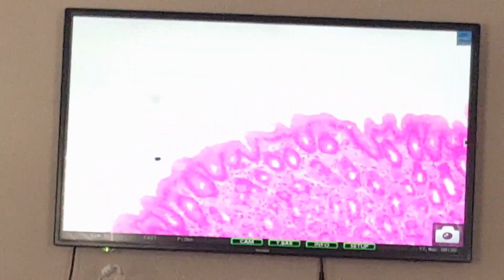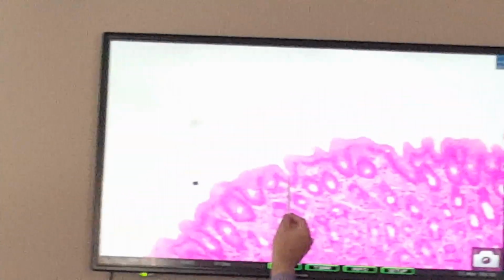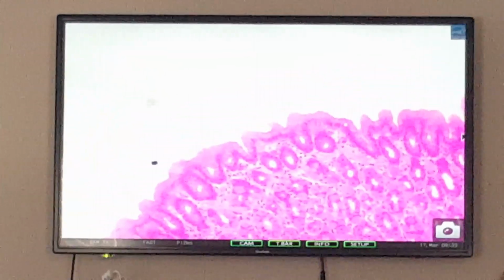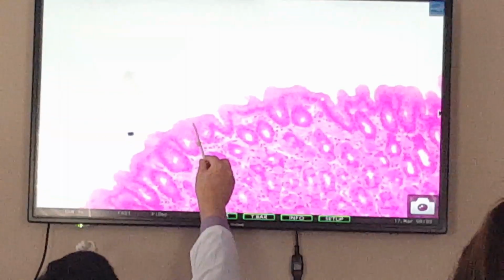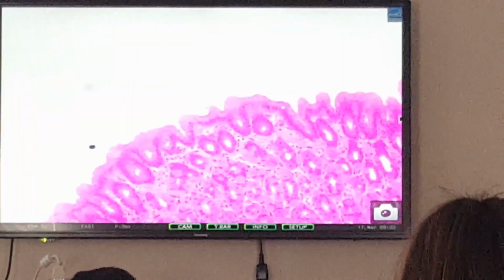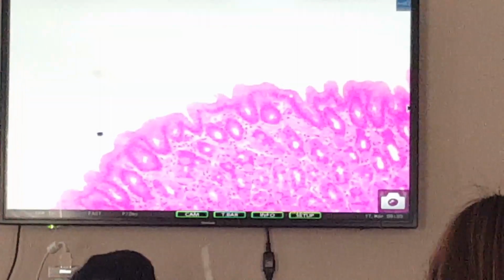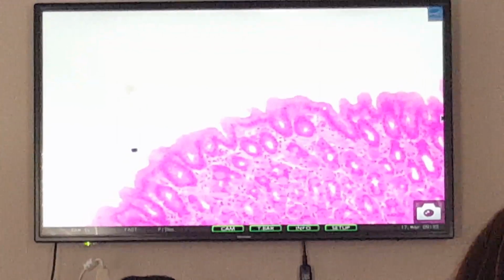So the stomach has goblet-like cells, and the reason we call them goblet-like is you see this light staining region along the apical surface of the cells. Well, that's a mucus-like material it's producing. It's a simple columnar epithelium, and then this is a gastric pit. Okay, here's a gastric pit. And coming off the gastric pit, coming down here, are going to be gastric glands.